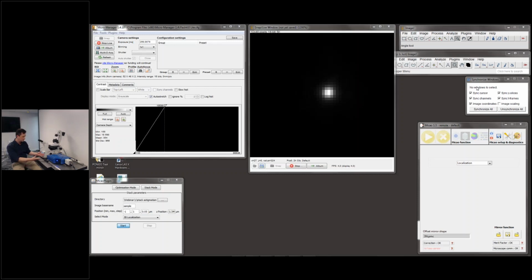So MicAO 3DSR is basically an adaptive optics device for correction of aberrations, specifically designed for easy implementation on the inverted frame microscope. Here you can see it's attached to the Leica microscope. So here goes a special thanks to Leica France, who kindly provided this microscope to us for this webinar.